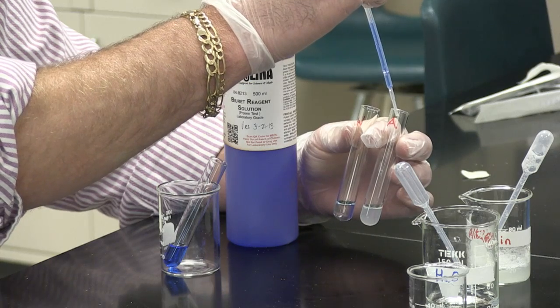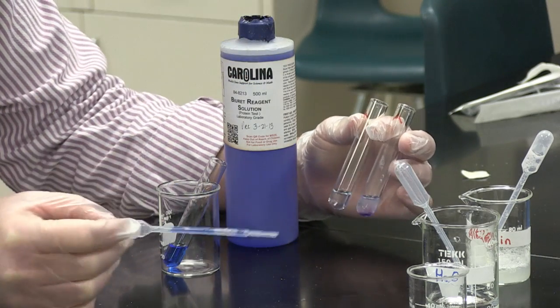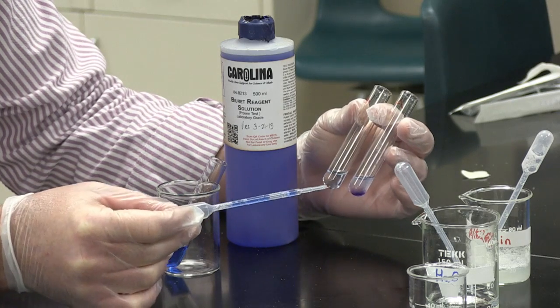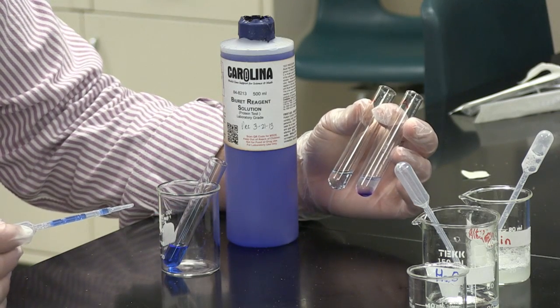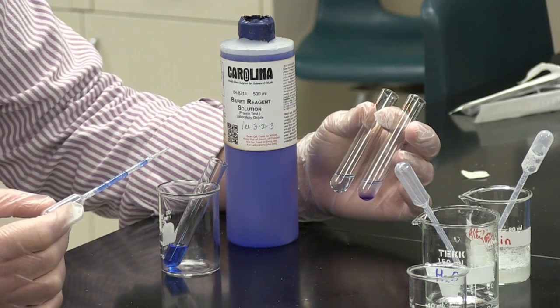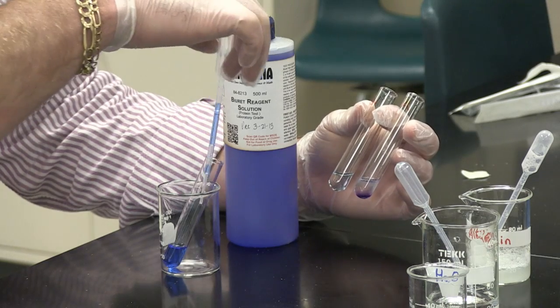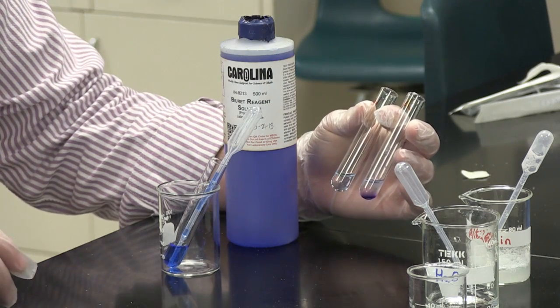Now let us add three drops to albumin, and you see we go from having a blue color to having a very dark purple color. So the Biuret reagent indicates the presence of proteins by turning from a blue color to a purple color.